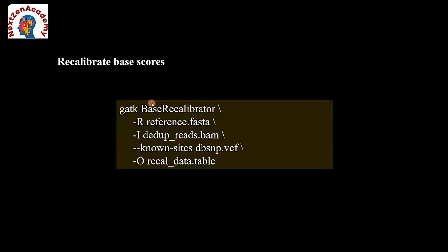Once we mark the duplicates, we need to do our recalibration of the base quality scores.